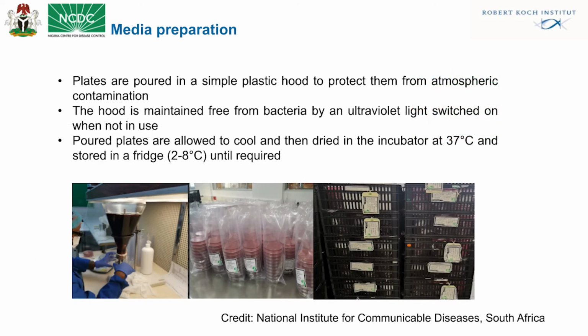Media preparation continued. Plates are poured in a simple plastic hood to protect them from atmospheric contamination. The hood is maintained free from bacteria by an ultraviolet light switched on when not in use. We pour the plates, allow them to cool, and then dry them in the incubator at 37 degrees Celsius and store them in a fridge at 2 to 8 degrees Celsius until required. We can see an example in the picture shown to us.